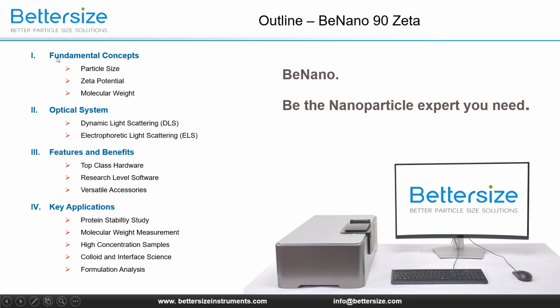This talk will be divided into 4 sessions. Firstly, 3 important concepts, particle size, zeta potential, and molecular weight, will be introduced briefly. Then the optical system of the BeNano 90 Zeta, including dynamic light scattering and electrophoretic light scattering, will be shown in schematic diagrams and animations.